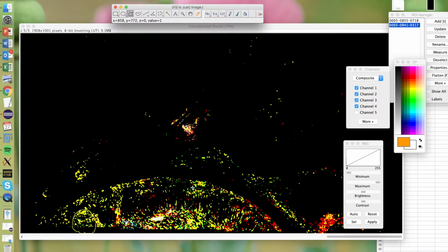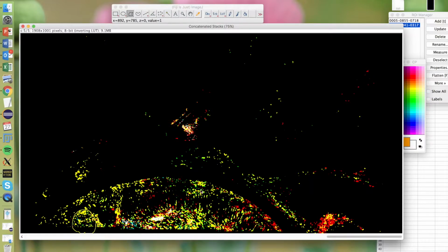Let's just draw around where I think the boundary is between those vertical fibers and the muscles adjacent to it. And notice that I'm going kind of deep off into the black there. And I'm going straight through the orange blob we did earlier.